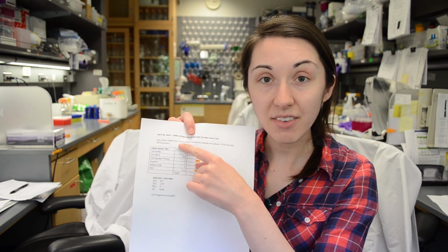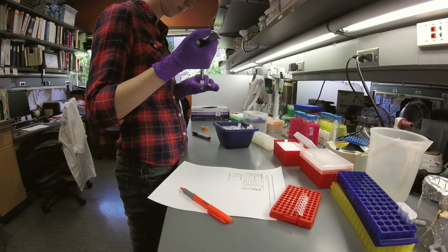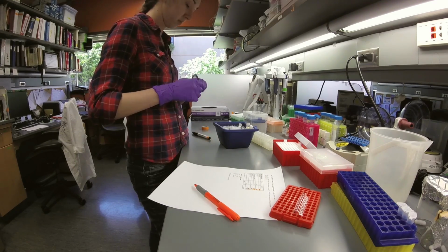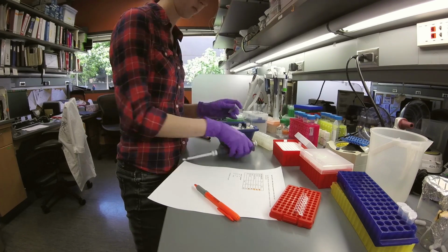Another thing I do to stupid proof is that as I add everything into my tubes, I cross it off on my list, or I highlight it. I'm a big fan of highlighting so I can still see the value underneath it very clearly, but I cross it off as I do it, and I do it in order. This way I know exactly what I have done. It's so easy to be in the middle of doing this and suddenly somebody comes over and asks you a question and you answer the question and then you look back at your tubes and you go, where was I?